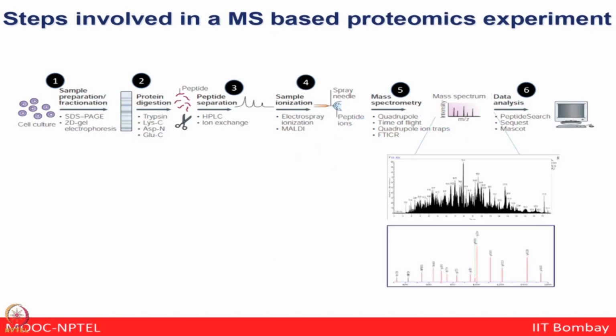From these instruments you generate these kinds of chromatograms, which are shown here in the insets, this kind of black forest, which shows you the Gaussian distribution of peptides coming out of these columns. From those you are looking at their ion information of B and Y ions, and then trying to derive the peptide sequence from this information using various types of databases.